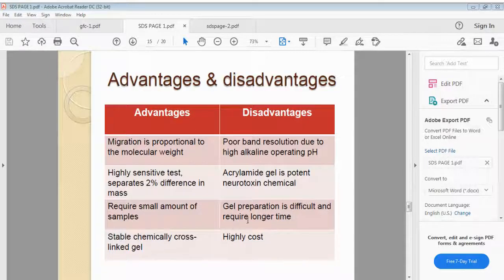That is a little difficult to do, but by practice you can attain this. That is why nowadays you cannot waste your time by preparing the gel, discarding the gel, etc. So what you should do is, people who are doing it for commercial purposes, where they have to show accurate results and handle many samples, will use a pre-prepared gel. Okay, and also it is costlier.